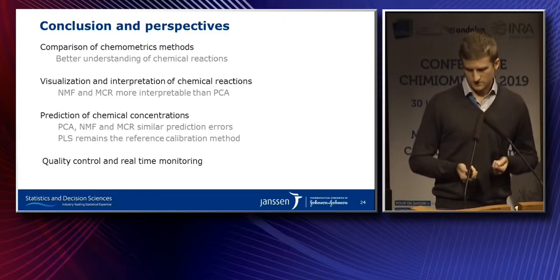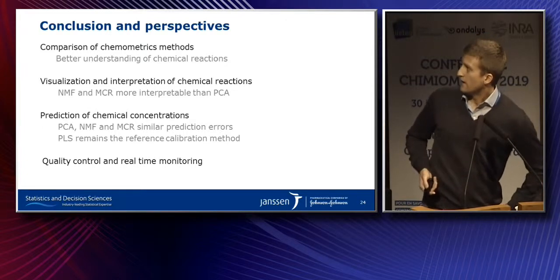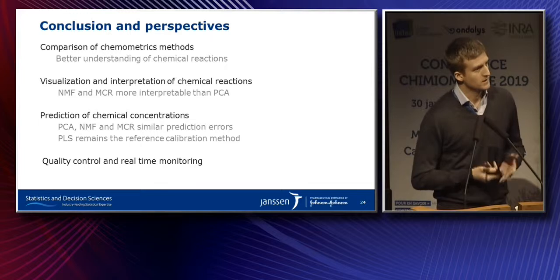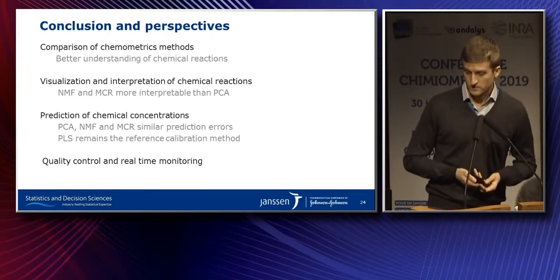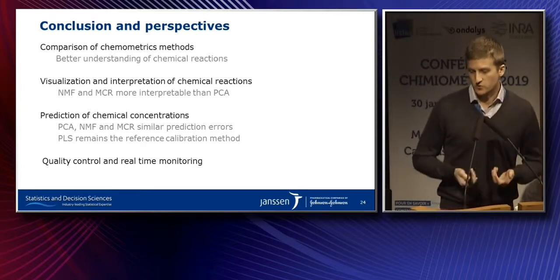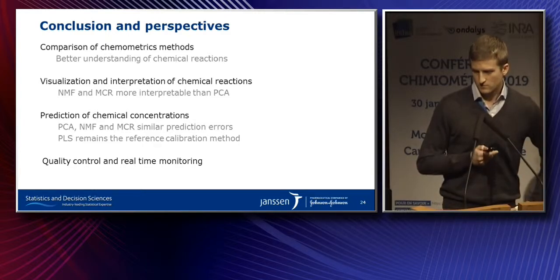For the second objective, which was to predict chemical concentrations, PCA, NMF, and MCR give similar prediction errors, but still the PLS method remains the reference calibration method. And those methodologies could be, for example, used in perspective for quality control or real-time monitoring.